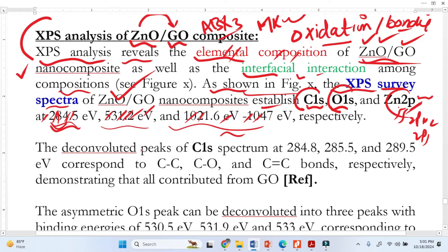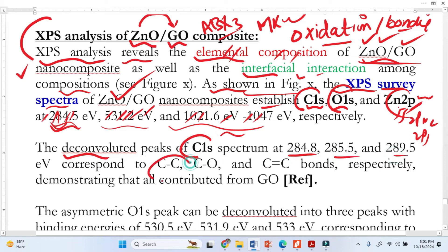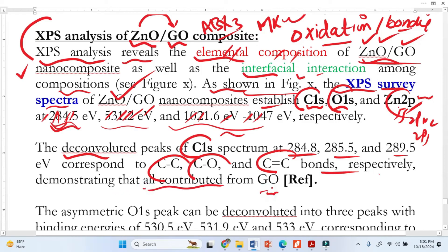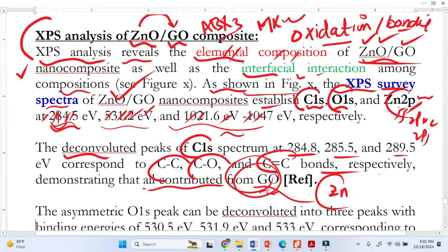Now we explain each peak in detail. For the deconvoluted carbon 1s spectrum: 'This binding energy corresponds to C–C bonding, this to C–O bonding' — and this demonstrates that all contributions come from graphene oxide. This peak comes from graphene oxide and has nothing to do with the zinc.